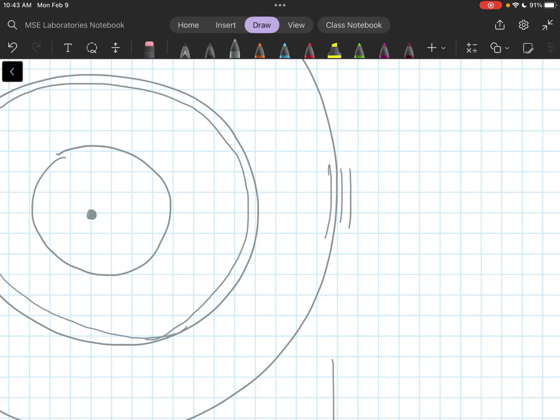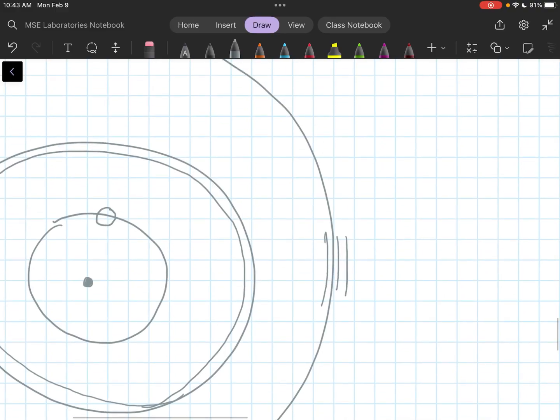A drop down from any of these layers to the middle layer, so let's say the hole is here, a drop down from here to there, or from here to there, we call that a K energy. We call that inner circle the K shell.